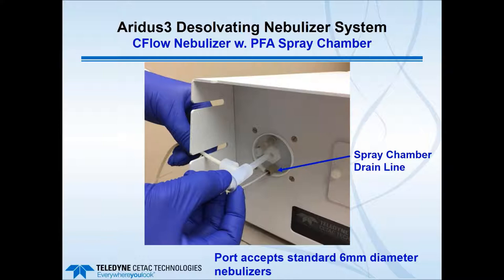If you move up to the 200 microliter per minute, which is kind of the upper range for the system, there could be some liquid buildup, or if you use the quick wash device for washing out the spray chamber, which I'll also show towards the end of the presentation.